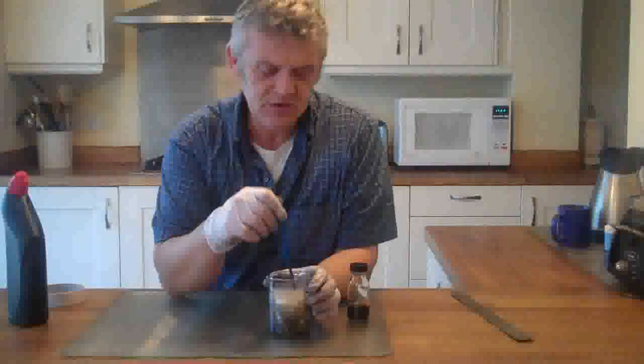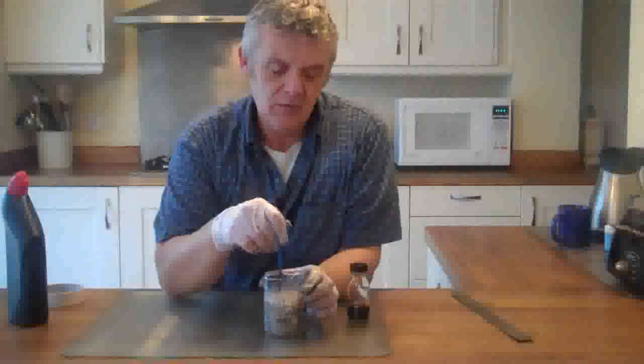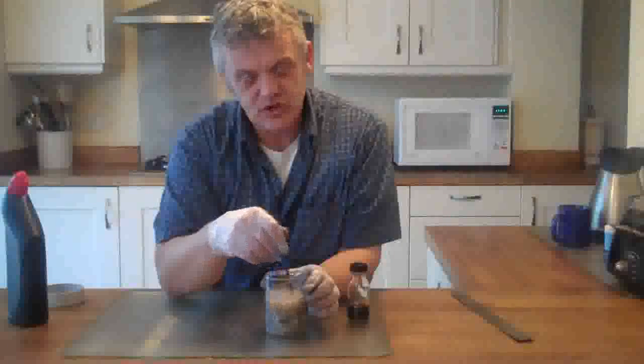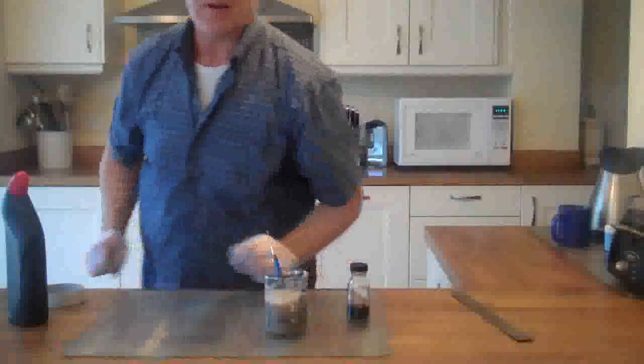A little update on this reaction. It's been going about 15 minutes, and you can see the hydrogen being nicely formed — that's why we're getting this froth. The graphene oxide gets lifted out, so you need to give it a bit of a stir to get everything back in there again. Then just leave it until it's completed. Keep an eye on it, and give it a little stir every now and then.